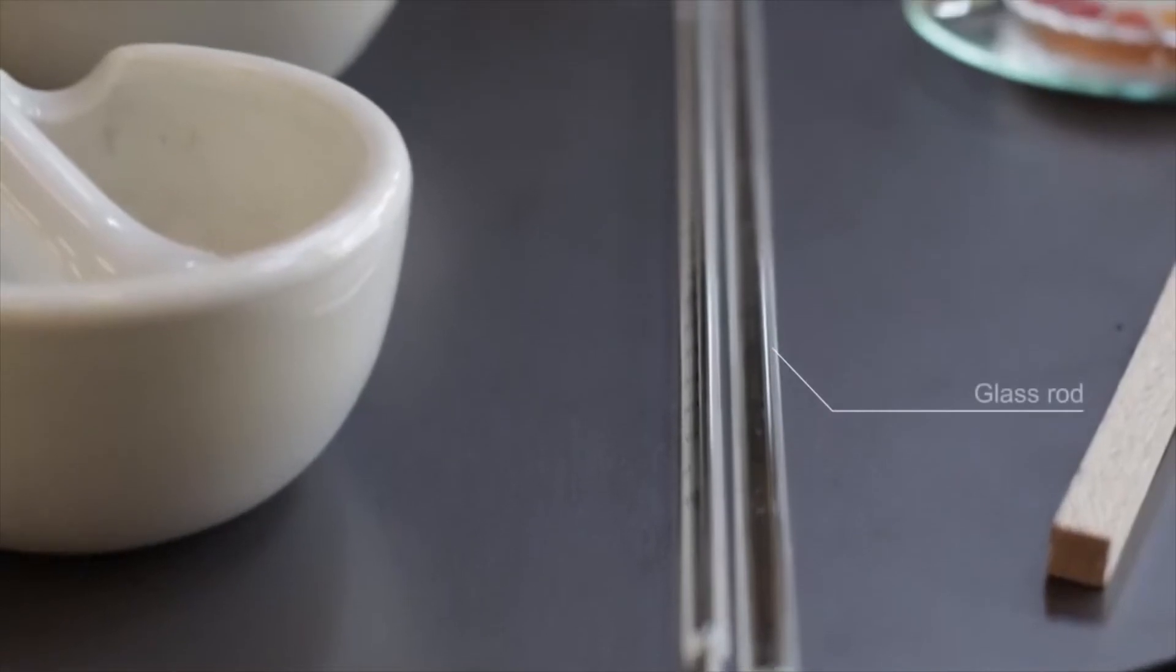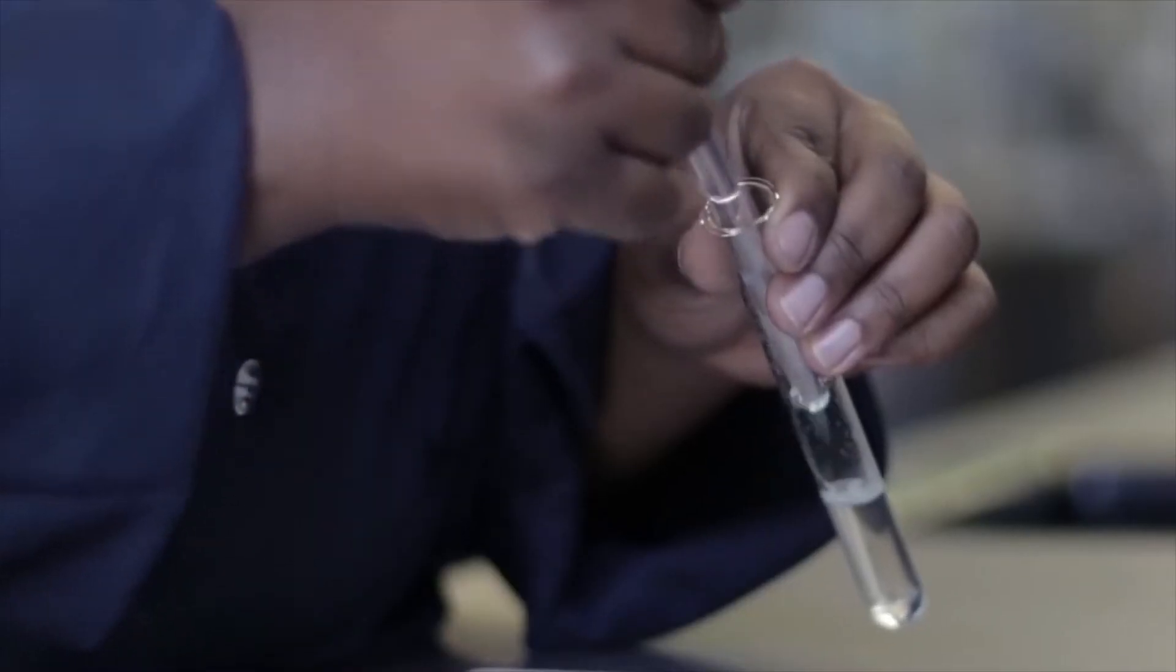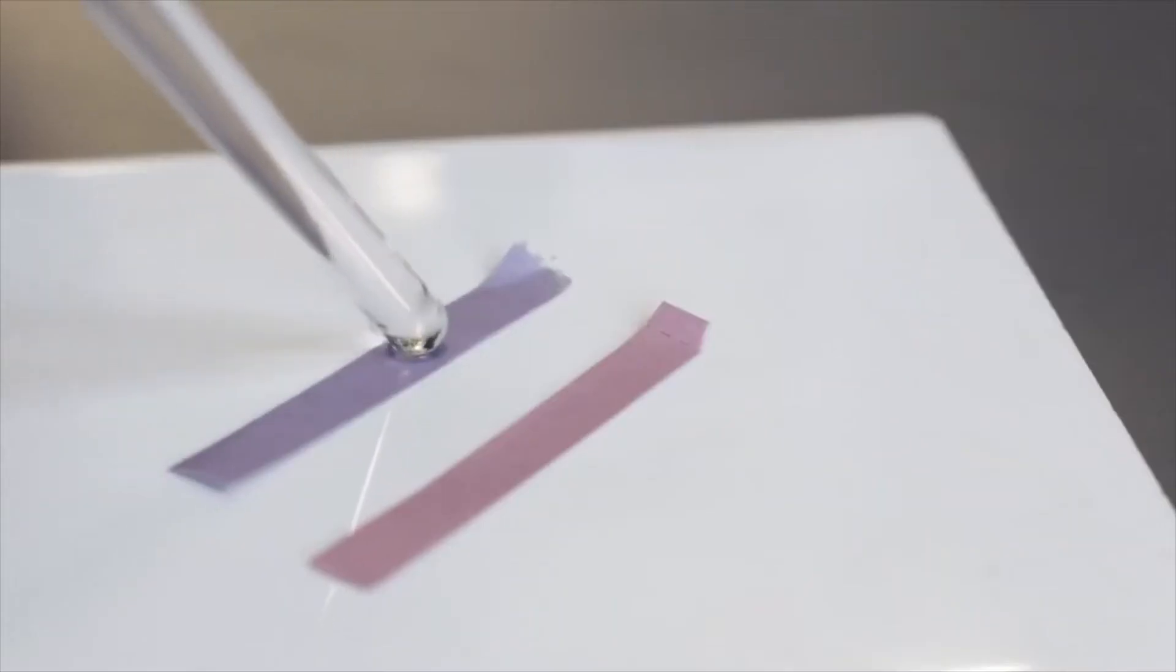A glass rod is used to mix chemicals and liquids and to dab litmus paper with solution to determine pH.